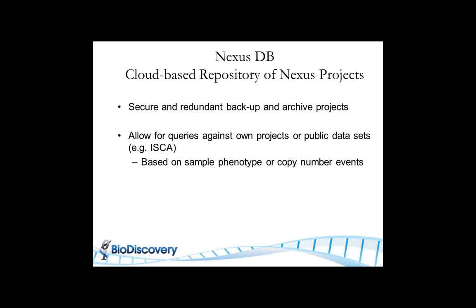You can also do query against your own projects or public data sets. For example, the ISCA data set, if you do constitutional samples, you can query based on the sample phenotype or even copy number events. I'm going to show you an example when I do the live presentation.